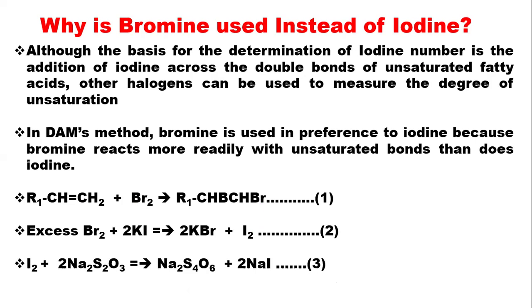Lastly, the product is titrated with standard sodium thiosulfate in order to estimate the liberated iodine resulting from the reaction in equation 2, and that is equation 3.